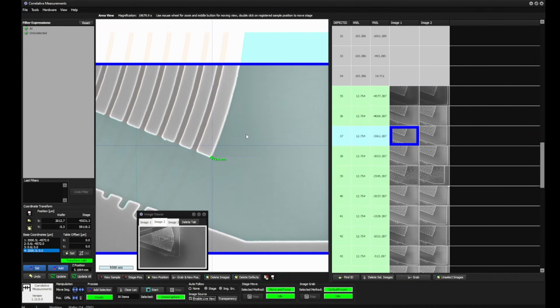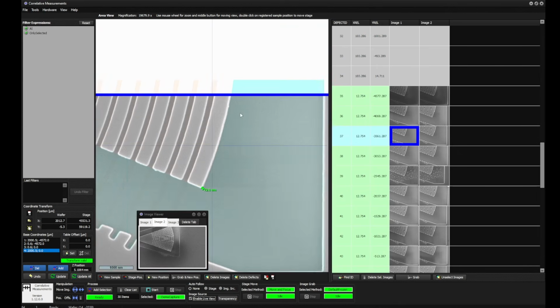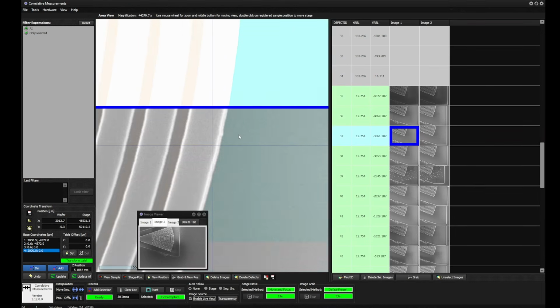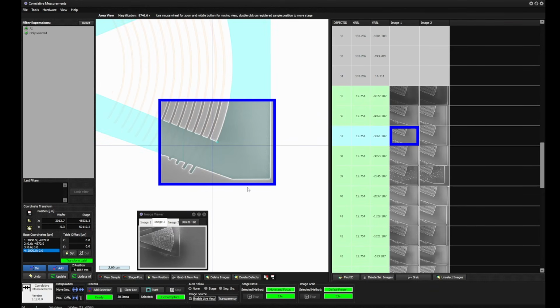72 nanometer, where it is very hard to express where the feature starts and where it ends, because here you can see this blue line starts actually where the bright pixel starts, so there's basically no deviation at all. So that worked quite nicely.